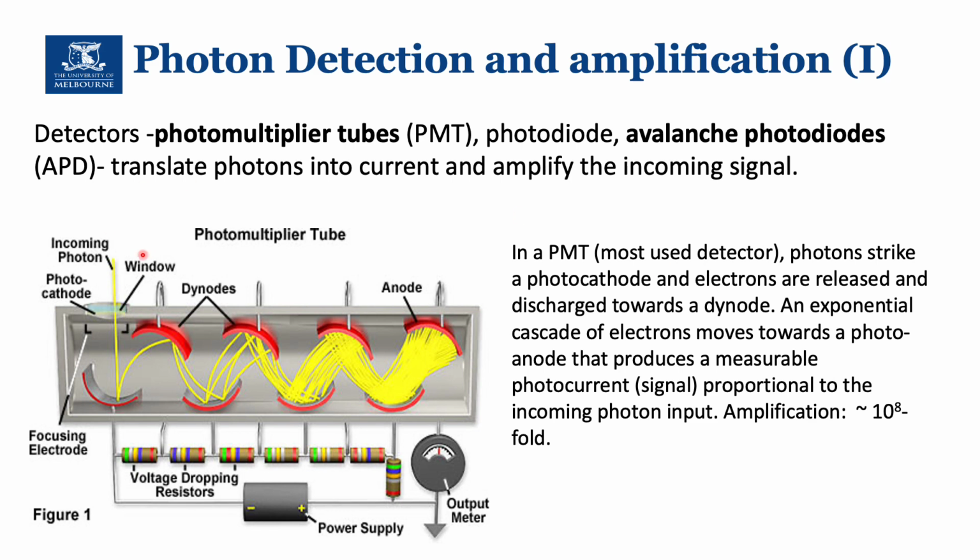And in the case of the PMT, what you have is a series of amplification steps that happen once the photon hits the PMT and meets the cathode. You get electrons that are produced out of the interaction between the incoming photons and the materials making the photocathode, and these electrons will jump through a cascade that will sequentially amplify further and further the signal, all the way up to 10 to the 8 times the incoming number of photons that arrive to the PMT. And it's extremely important because it will allow us to measure something out of a signal that is extremely dim.